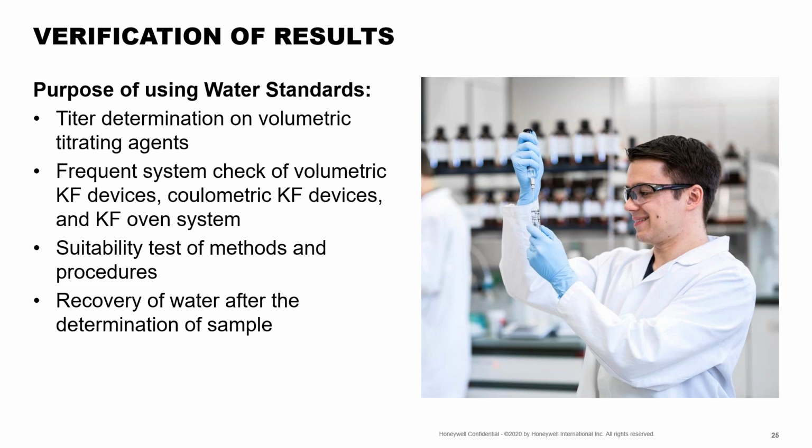And that can just make it a lot harder to get a really tight RSD on those results that we're using. Again, water standards themselves could really be just an entire webinar. So this is just a quick and dirty, some general rules of thumb to keep in mind. If you're interested in more information, we do have a ton of documentation on water standards themselves, and as I mentioned, in each of those individual boxes, you'll have really helpful rules of thumb and procedures to follow when working with them.